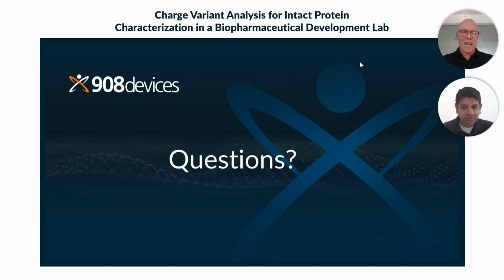Yeah, I mean, we haven't done a systematic comparison. So the answer is no, but I can say just by judging the profiles, we almost always get something that is very similar. And that gives us, of course, confidence. At the end of the day, if you're uncertain whether the impurities are different, we would probably do some stress studies to provoke the impurity we are expecting to get pulled out. But overall, I would say we get a similar profile.